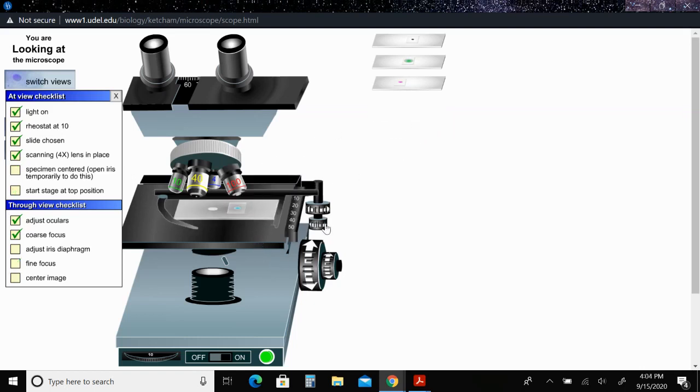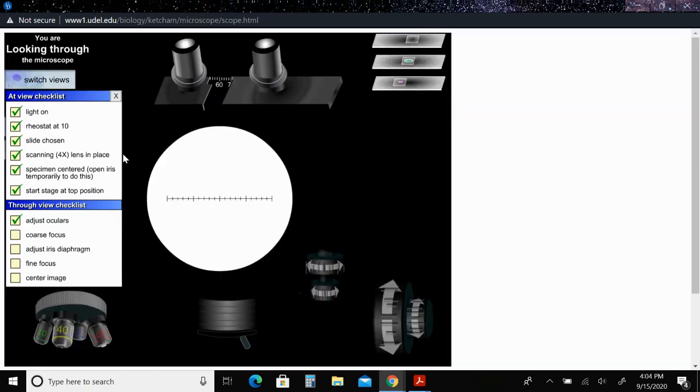Okay, center my slide, raise my stage. Okay, I can lower until I see something, all right.